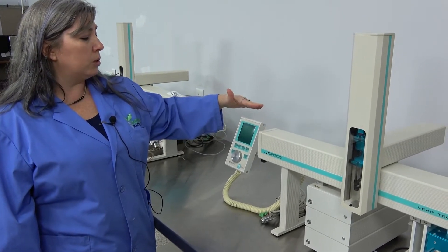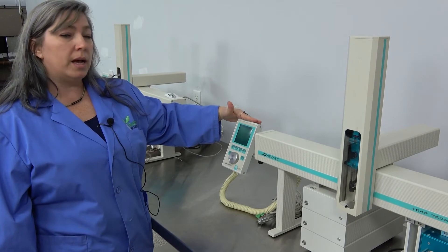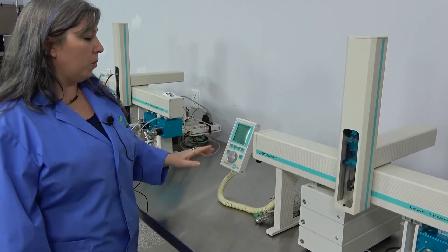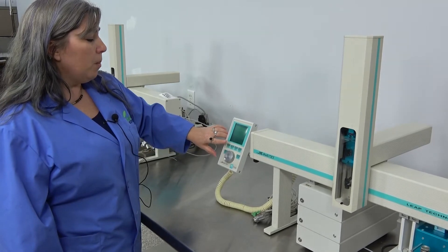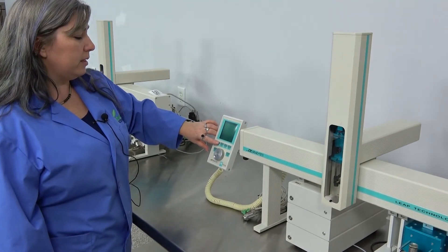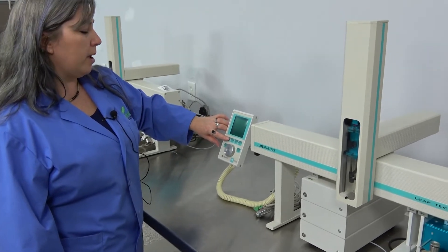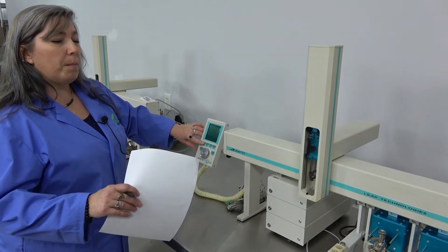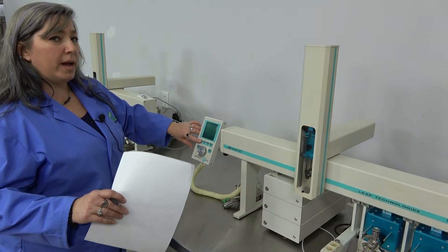We're going to run it through some pre-programmed independent tests just to give you a preview of how it works. By using the controls on the pendant, you can pre-program in locations of the various stops anywhere on the x, y, and z axes.